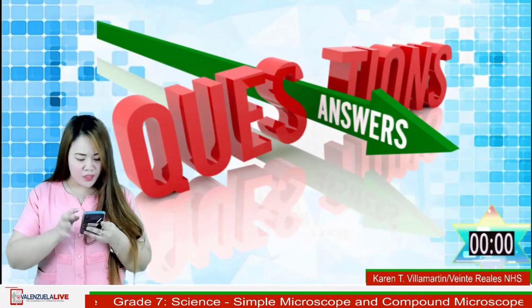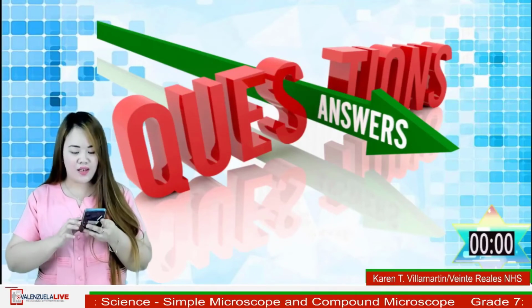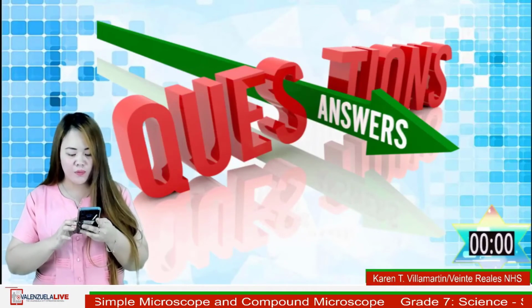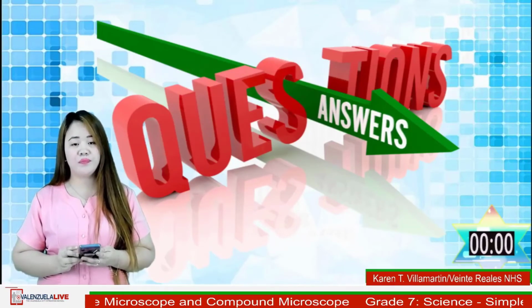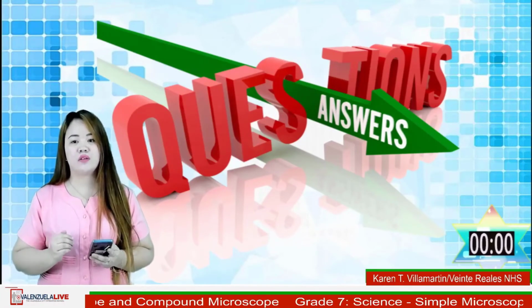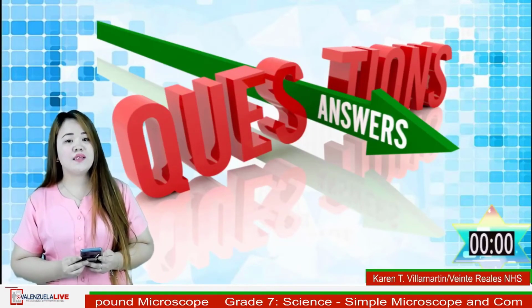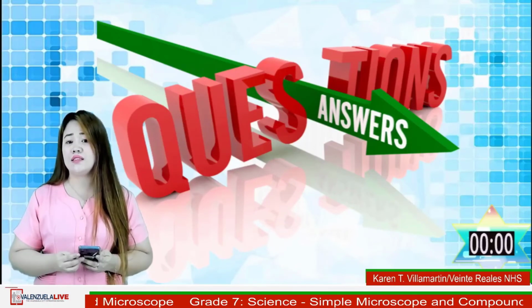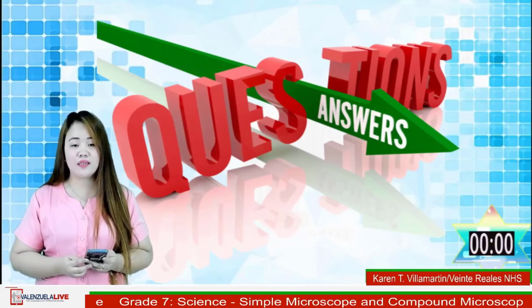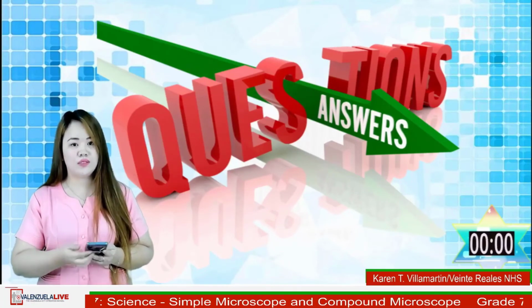Okay, so our next question is from a student in Malinta National High School. Ma'am, what is the advantage of a compound microscope over a simple microscope? So the advantages of using compound microscope over a simple microscope are: first, high magnification is achieved since it uses two lenses instead of one. Second, it comes with its own light source. Then third, it is relatively small in size. It is easy to use.